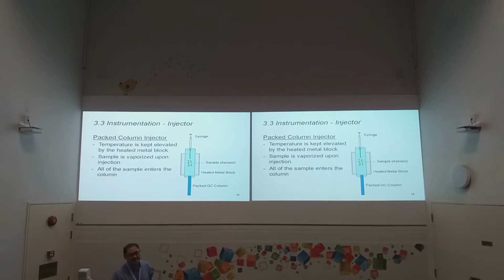If you understand this, then when you are in the lab and you handle the instrument, other than scientific things, we also need to pay attention to safety. When you handle components like the injector, bear in mind that temperature is a potential safety hazard, so you need to be careful.